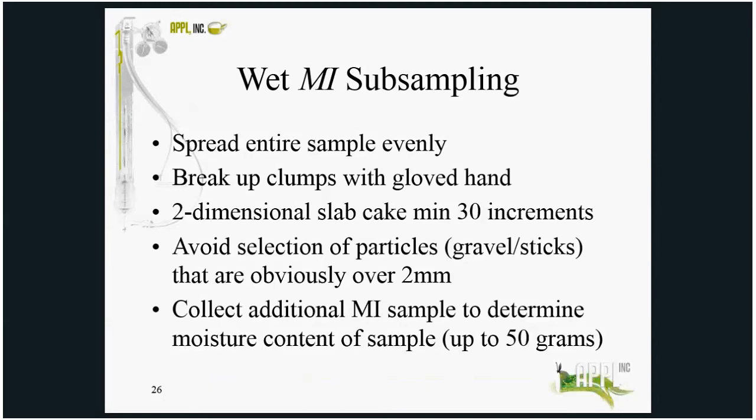Now, since this sample is not air dried, you're going to also need to take an incremental sample for the moisture correction. And you can always take a larger mass for the moisture correction also. The larger the mass, the better the reproducibility.